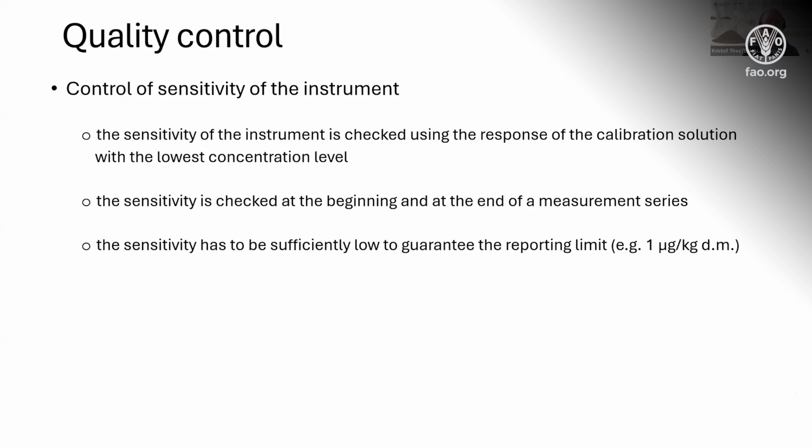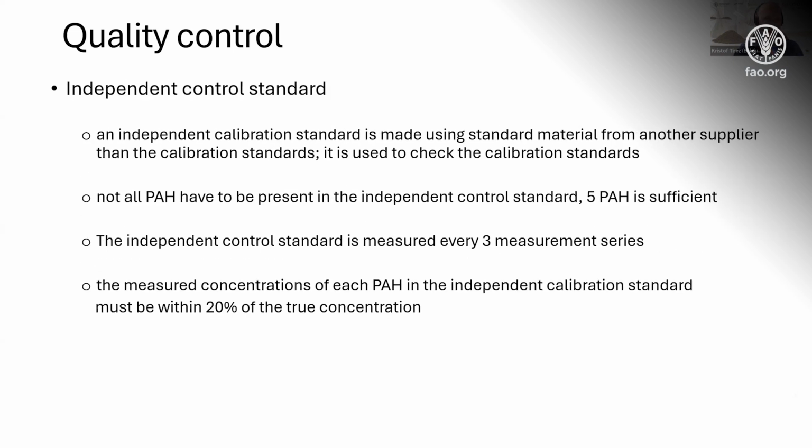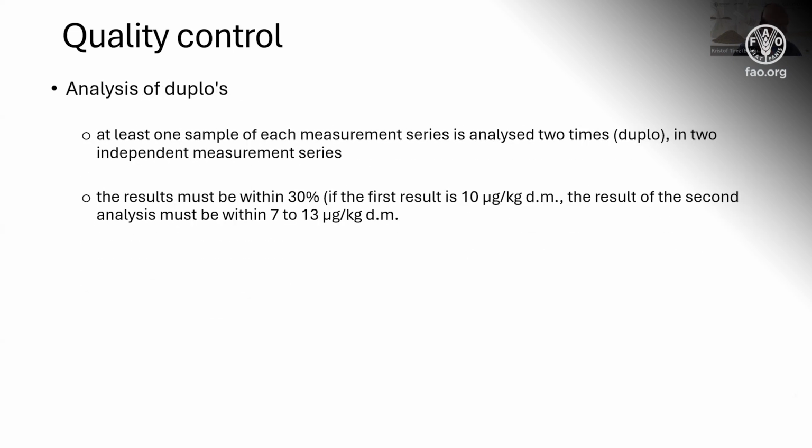Okay. With narrow, you mean less than 30%? Or even better? In general, you have 10, 15%, as RSD, so relative standard deviation. Okay. So it was just to get an idea of the expectations of the uncertainty you may expect from these kinds of measurements. Okay. I think that was it regarding the quality controls.